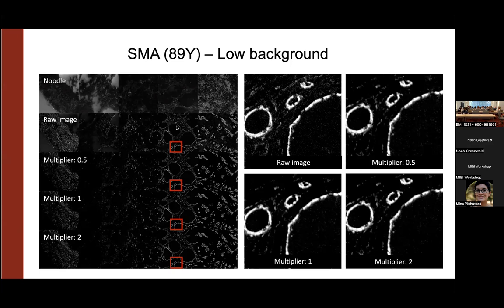A couple people had questions about what they did. They noticed that the images look smooth. Can you talk about why that step? This is the Gaussian blurring. Yes, exactly. There's one example that I can show you, but maybe, Noah, you could talk a bit more on this, because I know you've done quite a bit on this front.